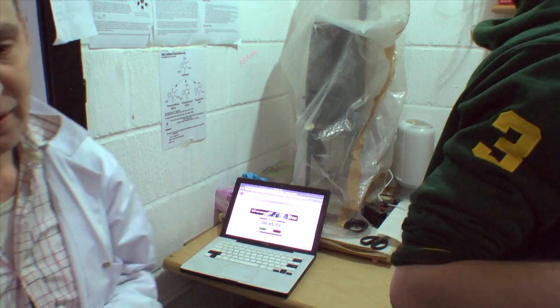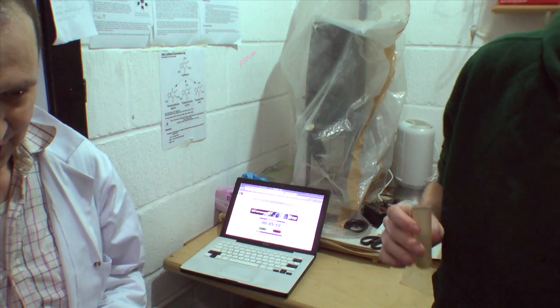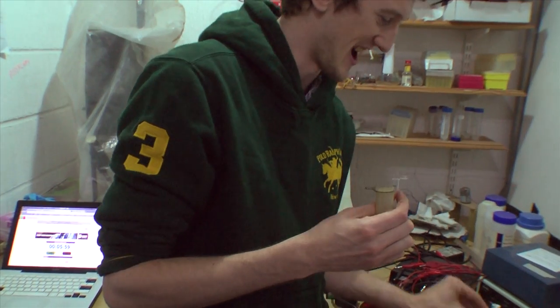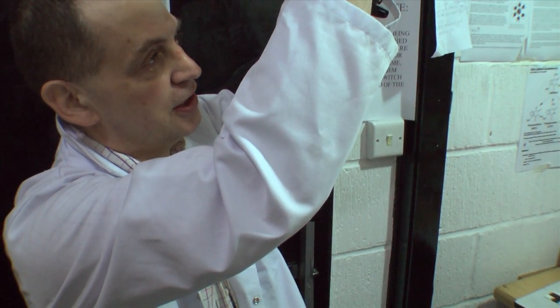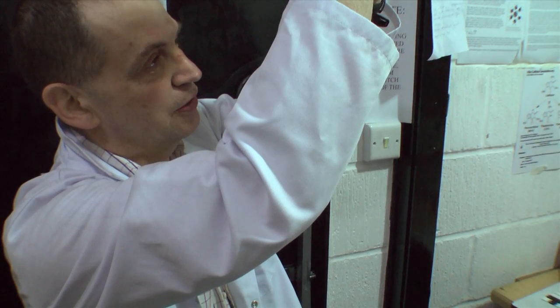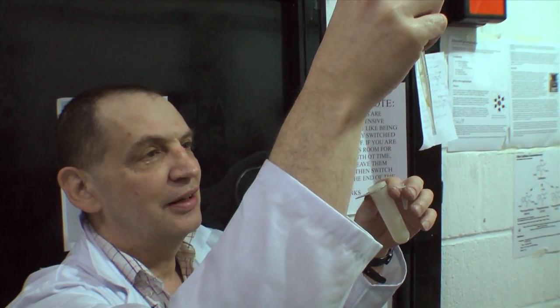You probably just didn't swish hard enough. Okay, so everyone take a tube and a Pasteur pipette and try and get your pellet into the little tube. Oh, success.